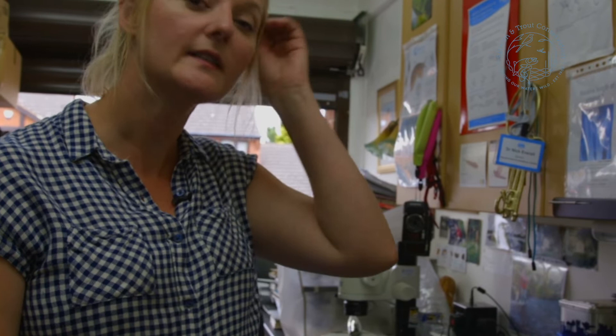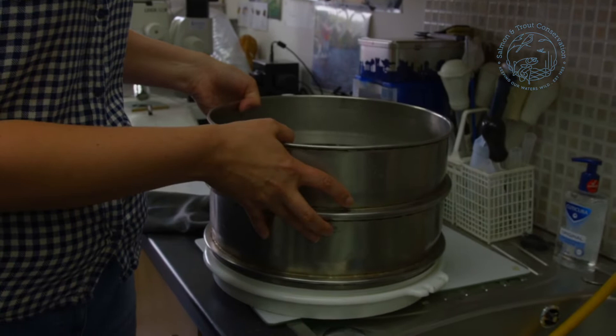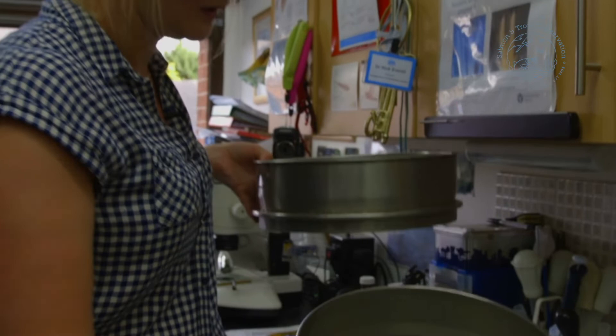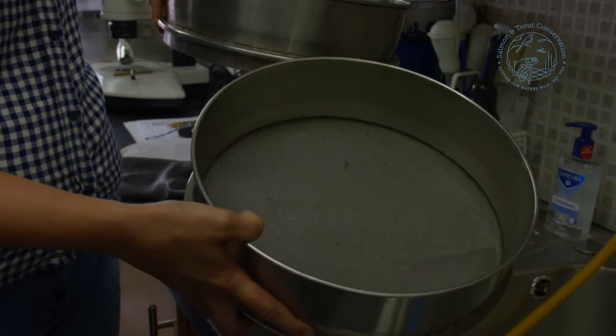Once you've collected your sample — and this is one that we collected in the Dove locally this morning — you're going to go through the process of cleaning and sorting. The first sieve is the big one which will get out most of the large matter without losing any animals. Then we've got our very fine sieve, and that's the one where all our animals will be collected.